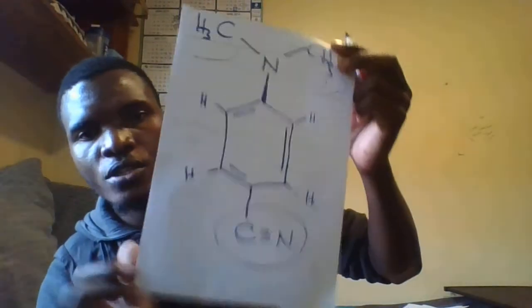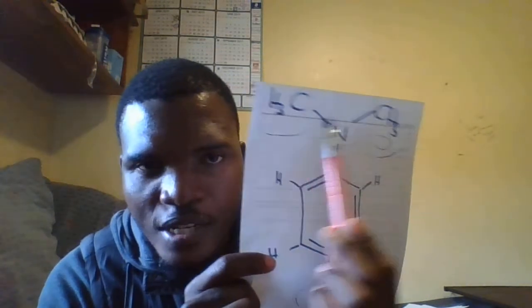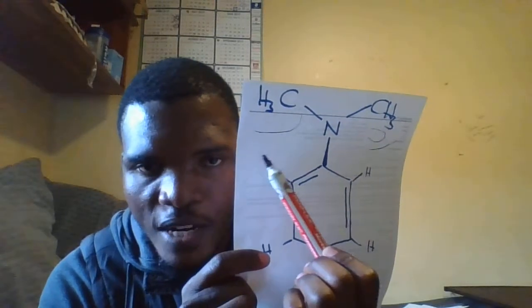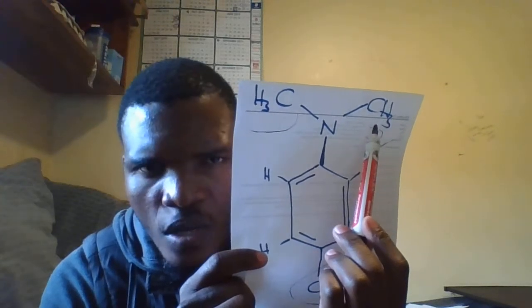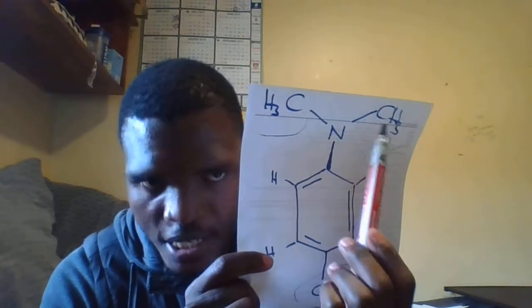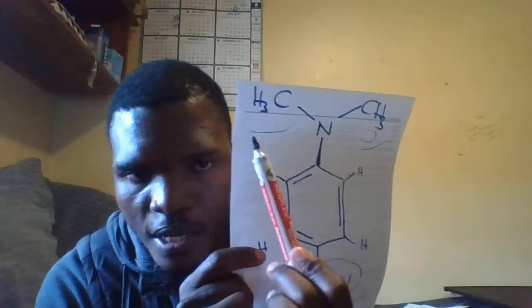And why do I say so? Because if you check here, you're gonna have this carbon and this carbon. It's your first pair of equivalent carbons. And in terms of the splitting pattern, this is the carbon that gives us a quartet, because they have 3 hydrogens attached to it. So because they are equivalent, they give us 1 peak.